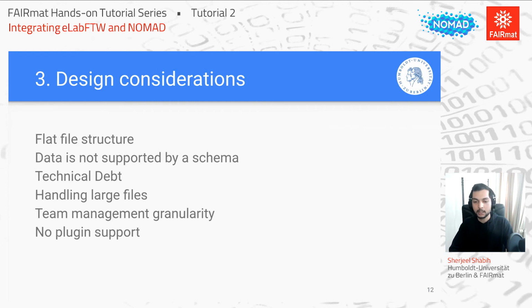We need an admin to create a new group or add that person to the group. Then it affects the visibility of all the other experiments. And then once that person is done with that experiment, it's not that easy to remove access as well. You have to contact an admin again, and the admin has to remove it.